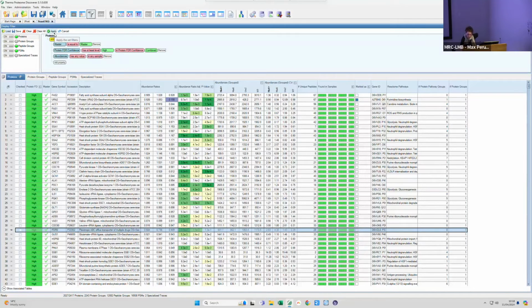You have to look into your data. Right. So filters. Here I'm actually using a filter. Because there are two different levels, once more, this is a quantitative project at the proteome level of these three strains that have been knocked down for different proteins. So there are two levels of information.